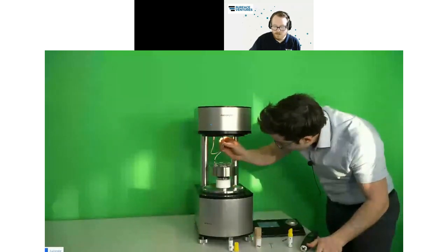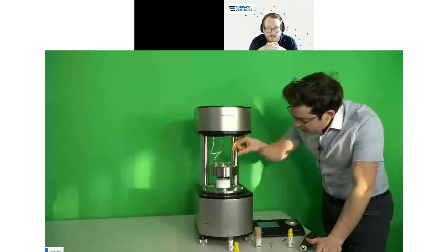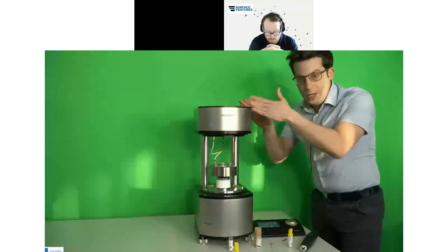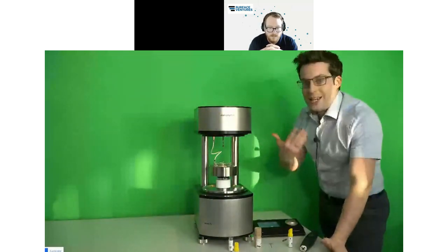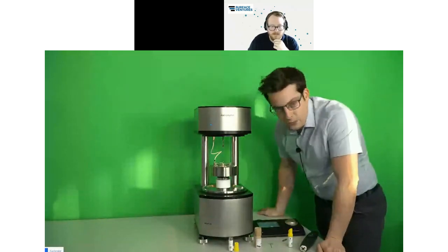Then we also, like before, mount it in our tensiometer, and then the stage goes up automatically. The fiber will be immersed in the water, and the device is recording the mass over time at the same time. So just imagine the implant that is now here on the stick. It can also be a very, very thin fiber, and the measurement works absolutely the same way. This is for single fibers.